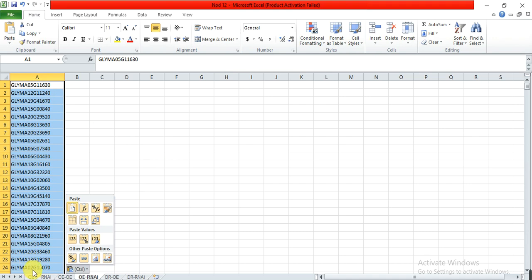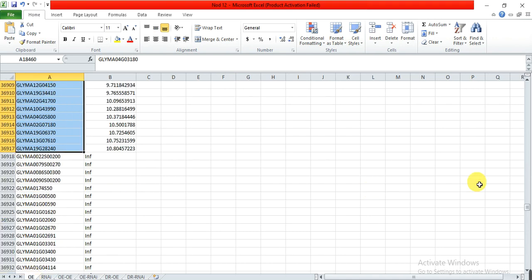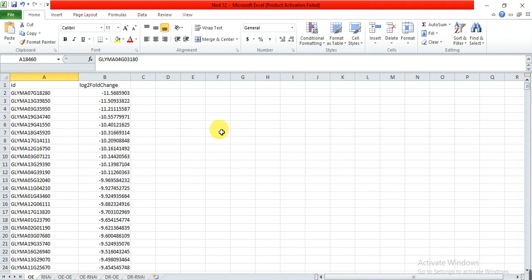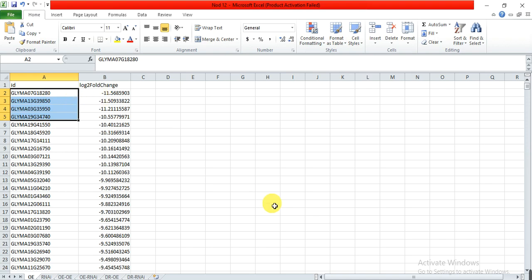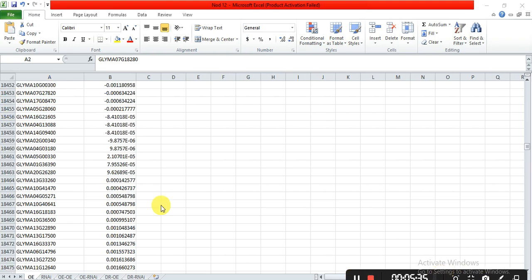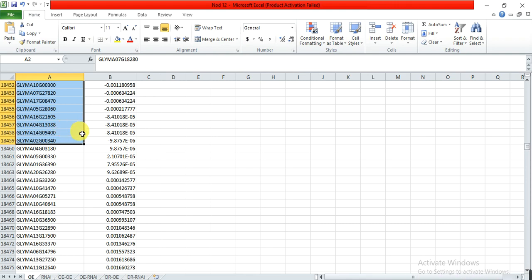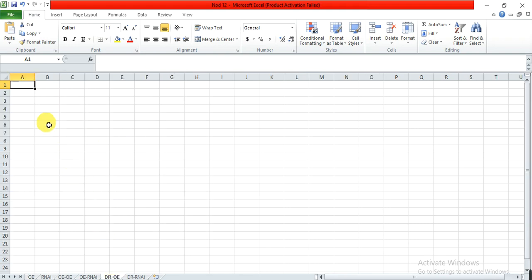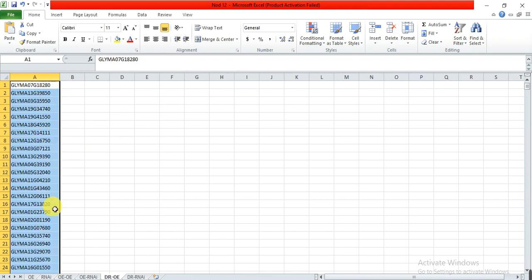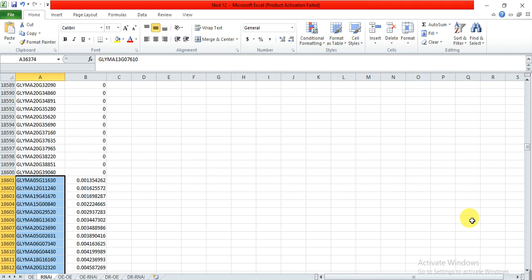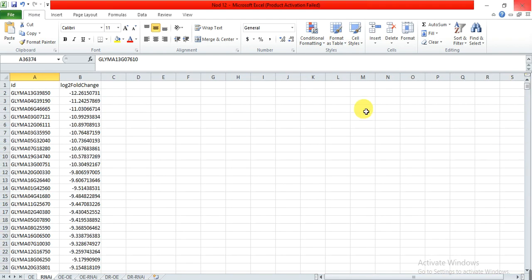Now we find the downregulated genes in our overexpressed lines — these have negative log2 fold change values. We copy these downregulated genes from the overexpressed lines and keep them in a separate sheet labeled 'downregulated genes in overexpressed lines.'